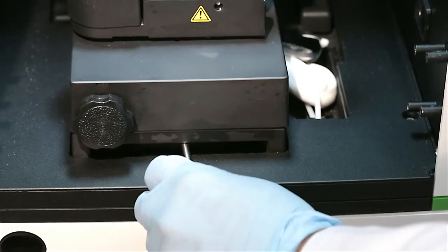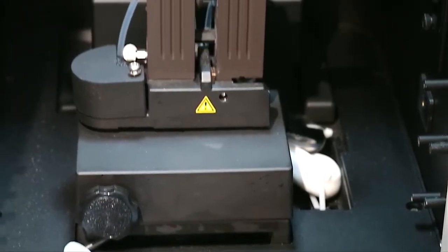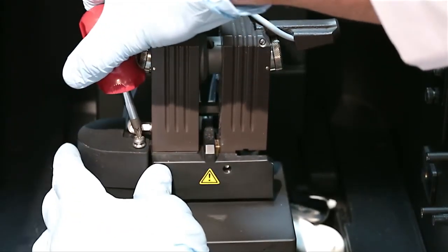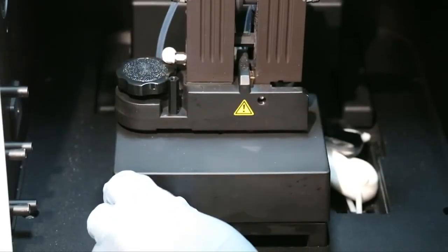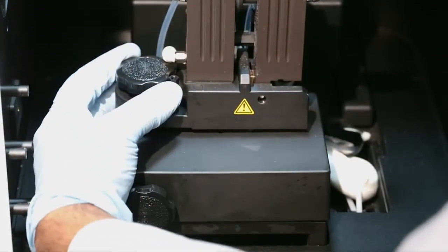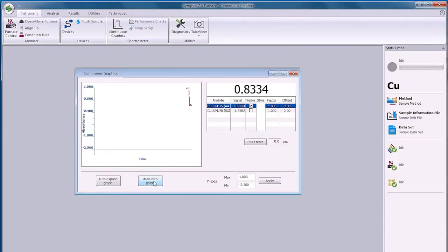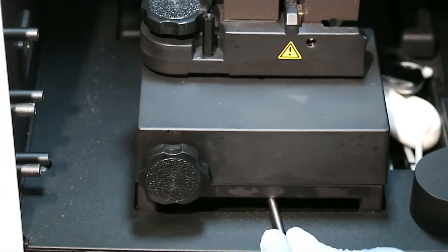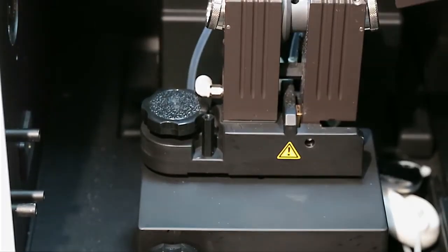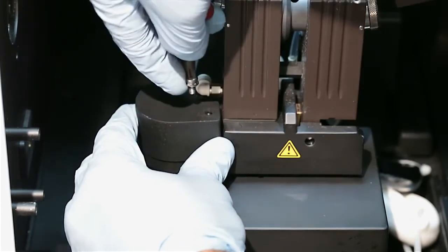Unlock the furnace by moving the locking lever to the left. Remove the vertical alignment cover. Rotate the horizontal alignment control in small increments to minimize the absorbance reading. Repeat the horizontal and vertical adjustments until the absorbance is minimized. Move the locking lever to the right to lock the furnace in place. Refit the vertical alignment cover.